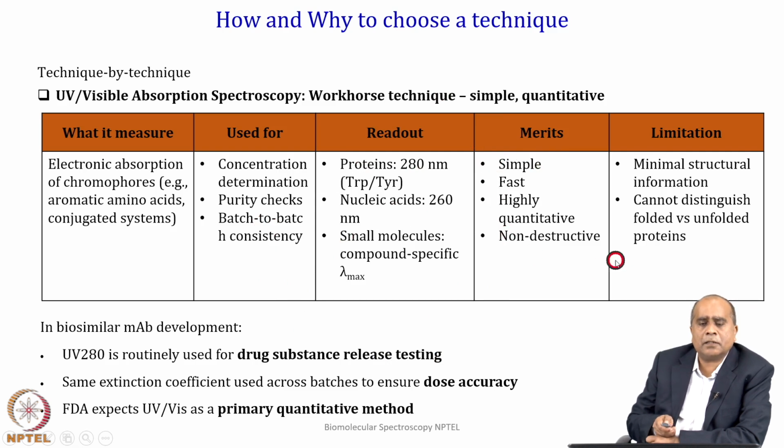quantitative, and you can recover all of your protein, as it is non-destructive. The limitation is that we really get minimal structural information, right, and it cannot distinguish whether my protein is folded or unfolded. It just gives you the concentration measurement of the protein.